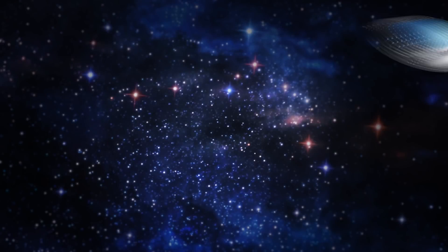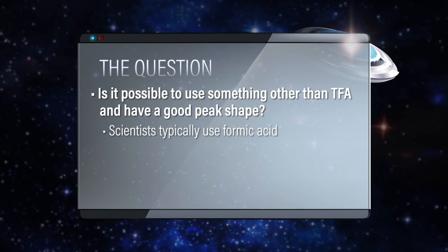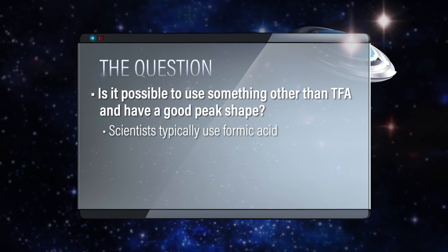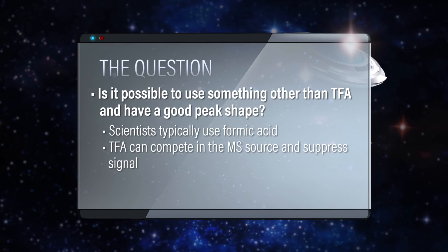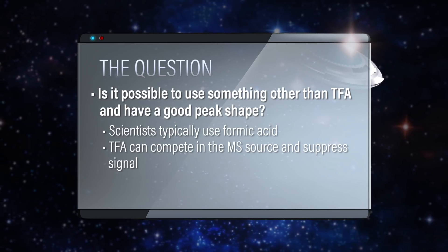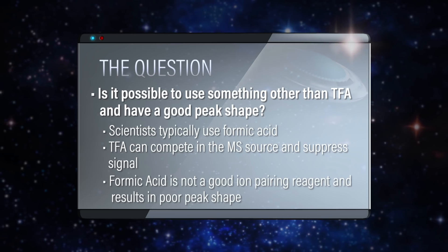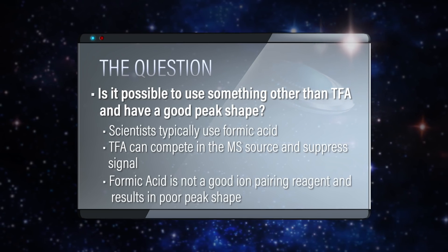But it really suppresses their signal. So they want to know if it's possible to use something else and get good peak shape. That's a great question. Typically scientists use formic acid because they want to get away from using ion pairing reagents like TFA, because TFA competes in the source and suppresses the signal — it creates all sorts of problems. Unfortunately, formic acid isn't really a good ion pairing reagent, and then you get very poor peak shape.